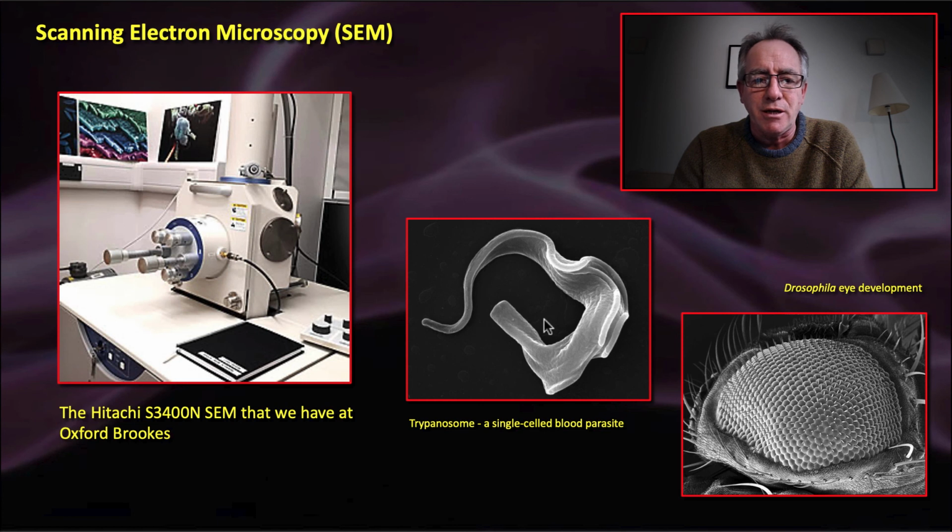People that study the blood-borne parasite called a trypanosome make all sorts of mutations of this single-celled organism that affect the body shape, and they're doing lots and lots of scanning electron microscopy to look at the shape of the organism once they mutate gene X or gene Y.